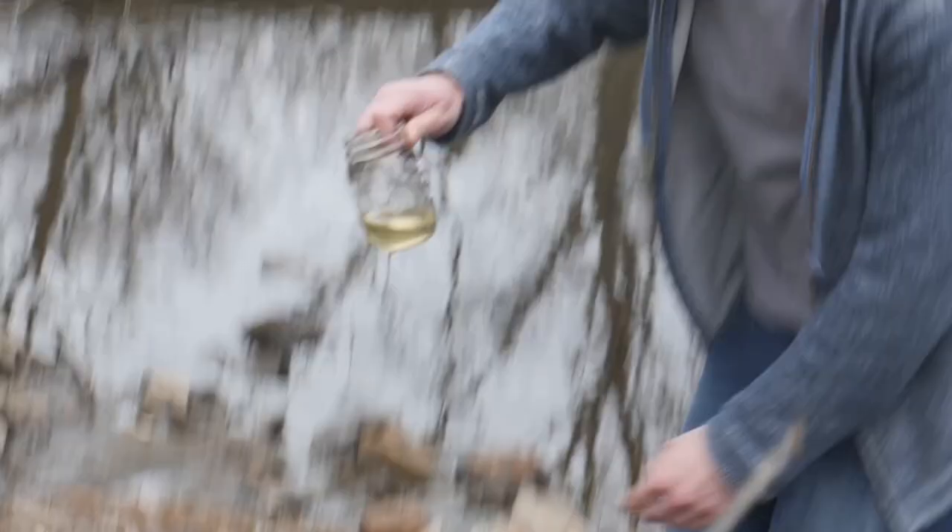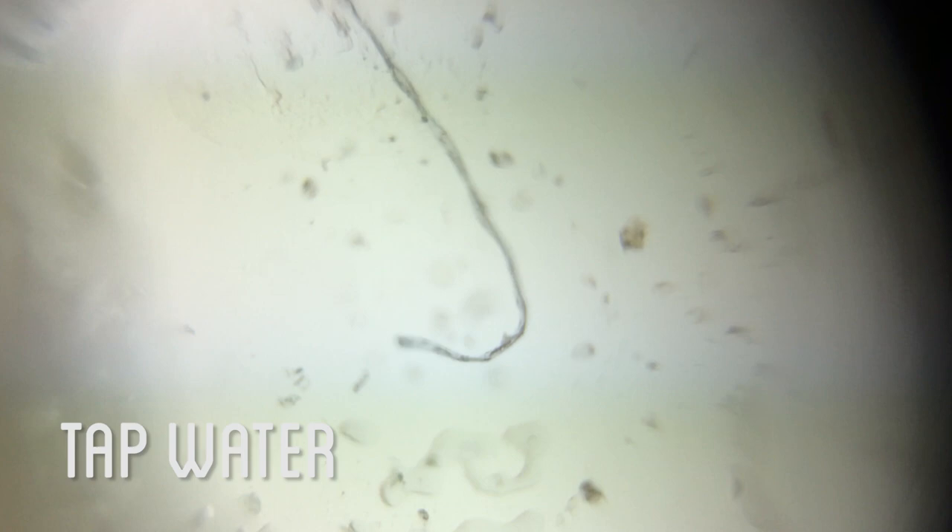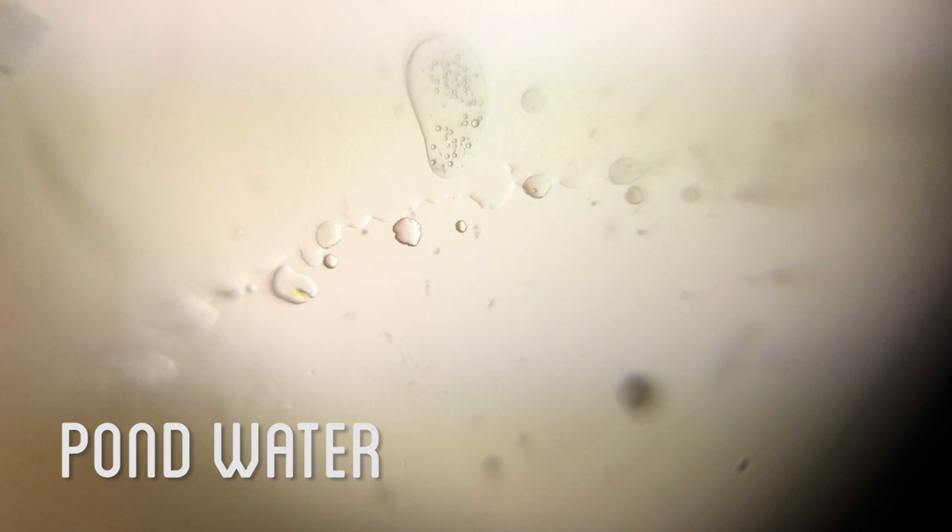To start out, Jared suggested comparing pond water and tap water. I took a drop and compared the two, but actually found it hard to tell what was just the adhesive in the slide, what were air bubbles that were trapped, and whether it was actual items in the water itself.